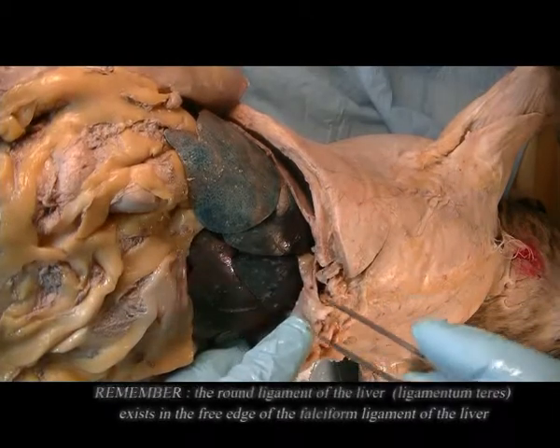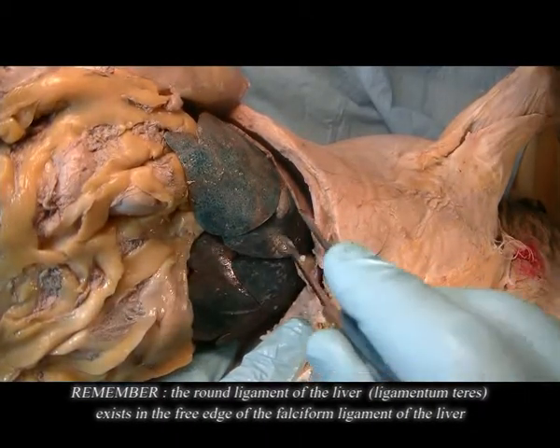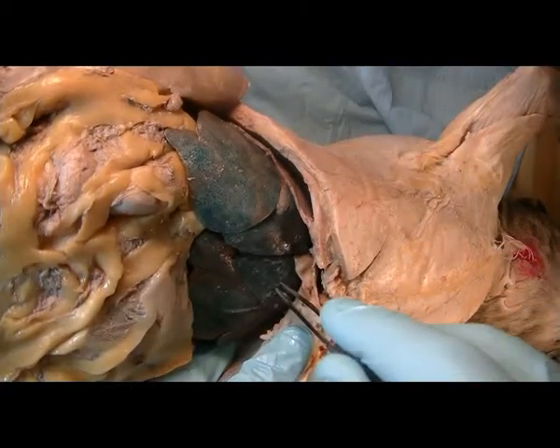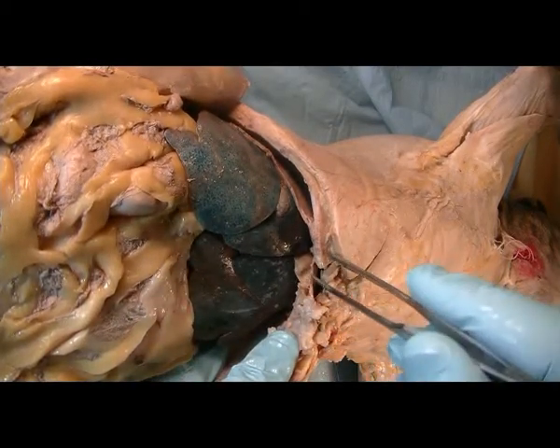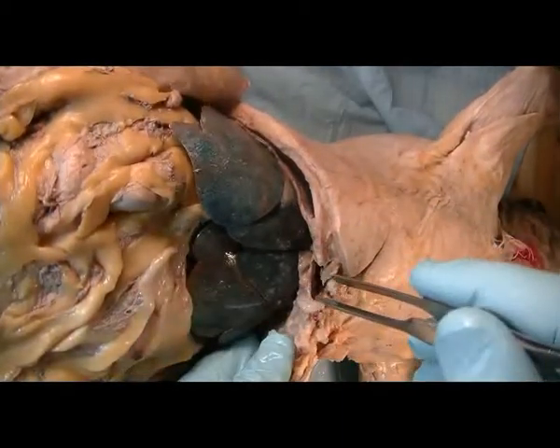And the liver, in the cat, has 5 lobes. Like I said, the falciform ligament divides the liver in half. So this would be the right side, because here's the midpoint, and this is the left side.